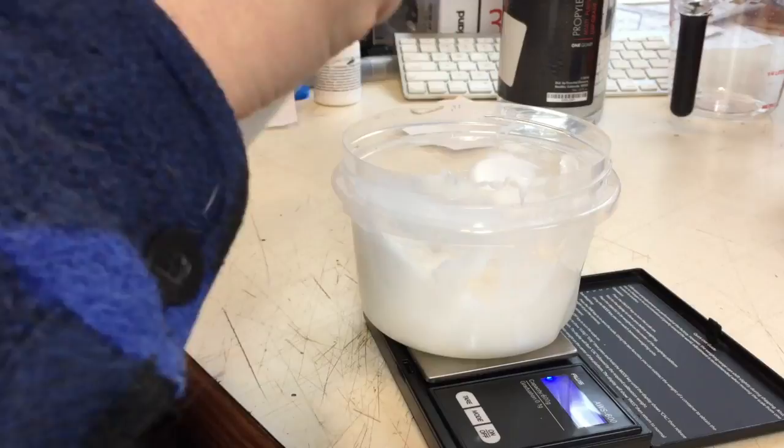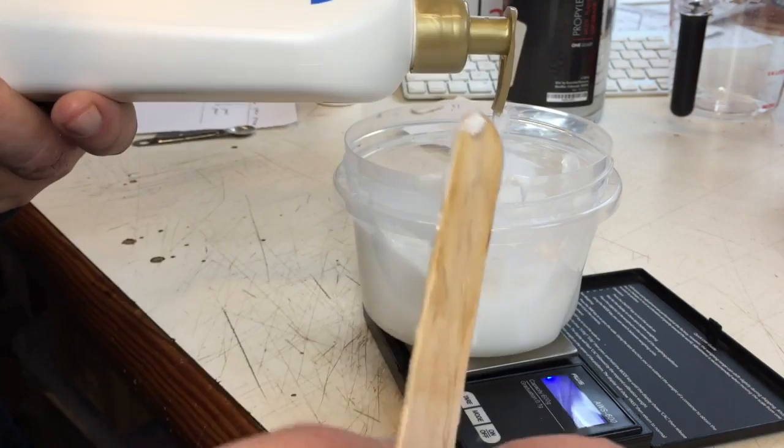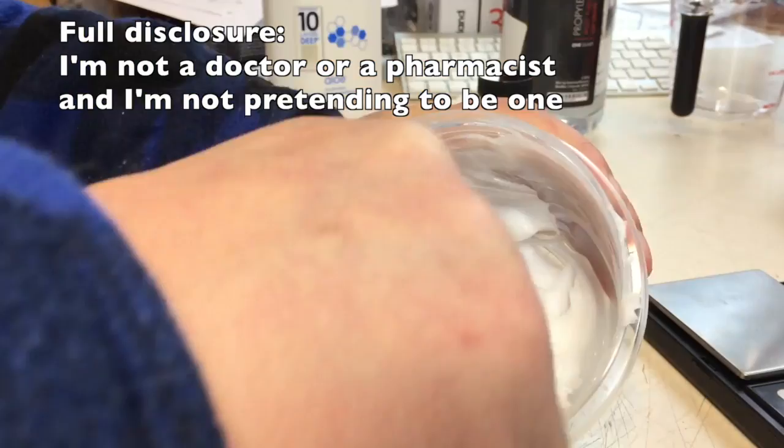It's reading 123.4 — for scientific accuracy I squirt a little more — now 125.2. I want it to be 126.1. Okay, 125.8. I think I'll have to be satisfied with that.